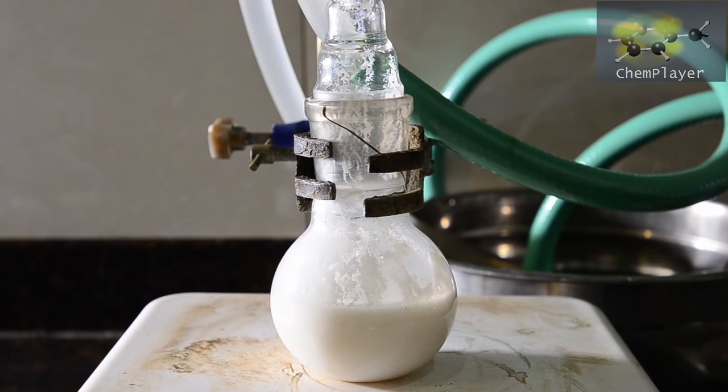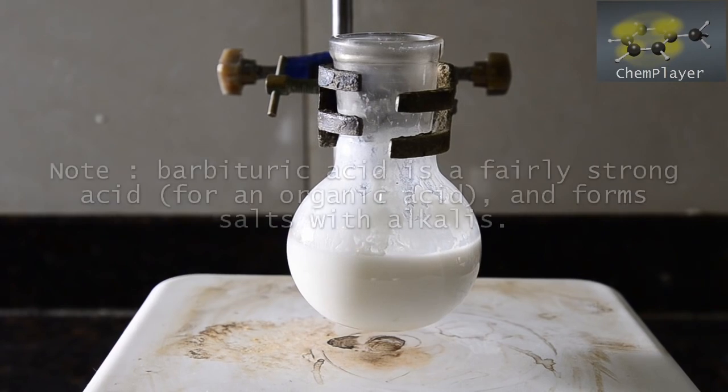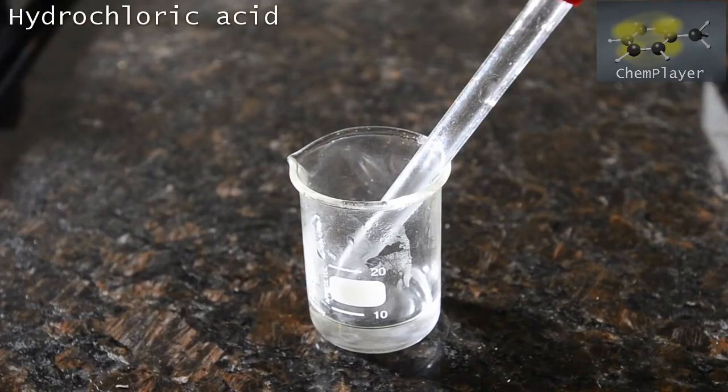We allowed the mixture to cool slightly and then dismantled the majority of the apparatus. Okay, our product should be in this mixture, and since it's acidic it will be dissolved as the sodium salt. Here's about 8 ml of concentrated hydrochloric acid in a small beaker and with a dropper so we can add it to the reaction mixture.